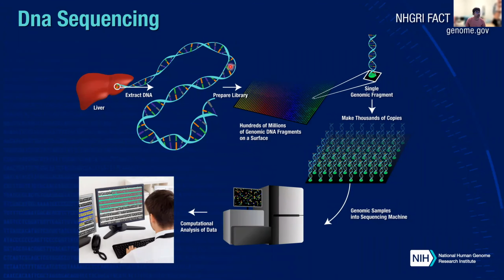So they chemically do it, and during that process these DNA strands break into little pieces. Then they do a step called PCR, where they multiply all these little pieces.